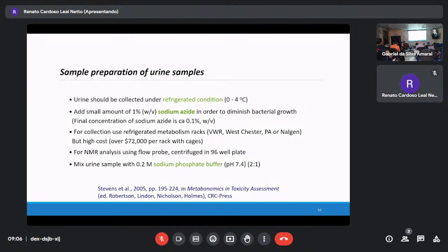Okay? Now add some amount of sodium azide. Sodium azide means NaN3. Why do we have to use it? There are thousands of antibiotics. Why do we have to use sodium azide? There are many variations, and I would suggest you can use others, but sodium azide is an antibacterial agent. Why have I selected it?